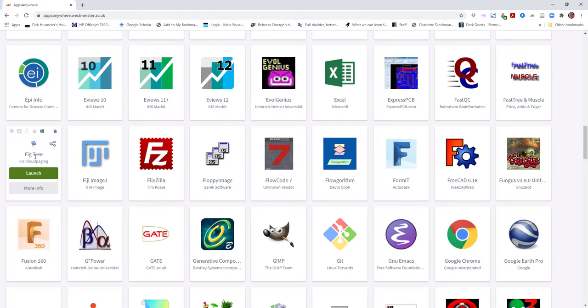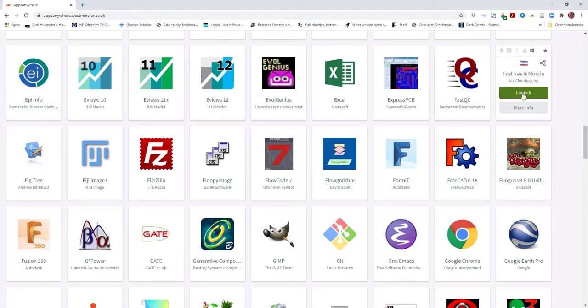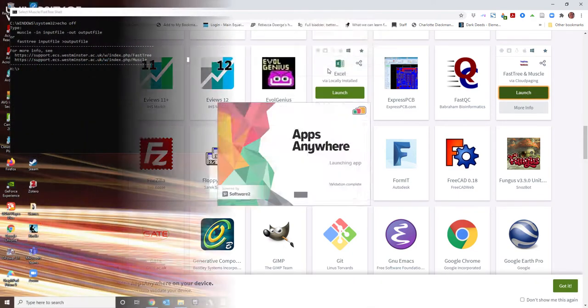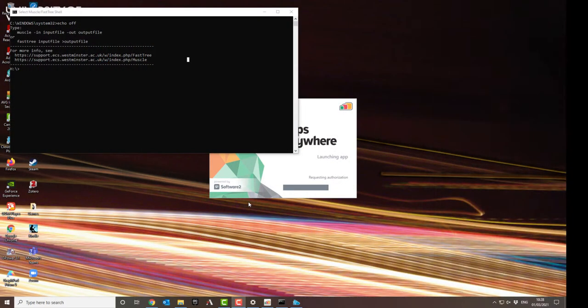Now to run FastTree and Muscle, you click on the launch button. This will open the Apps Anywhere launcher, which you then have to authorize to allow it to install the software on your PC. You'll then open a new window on your PC.